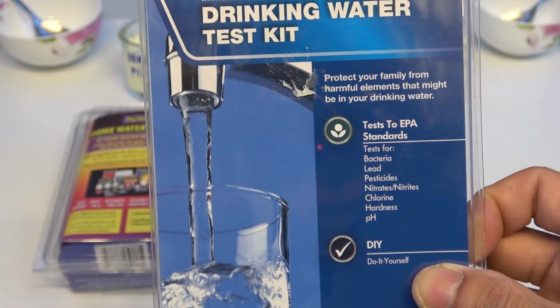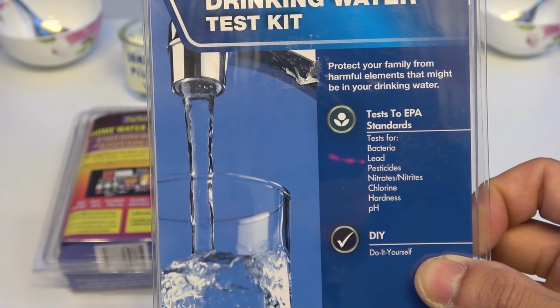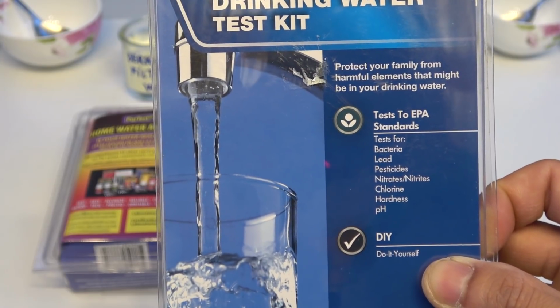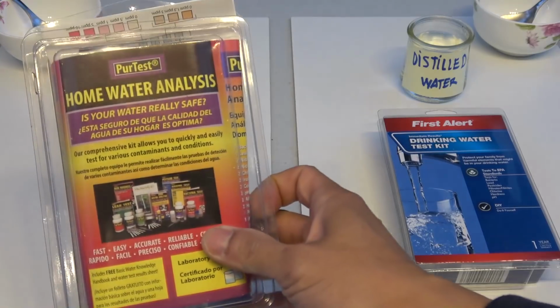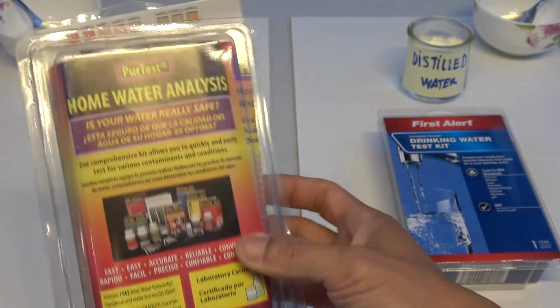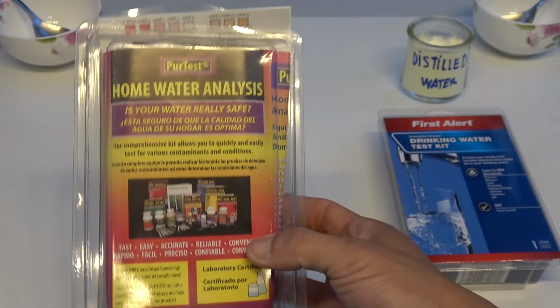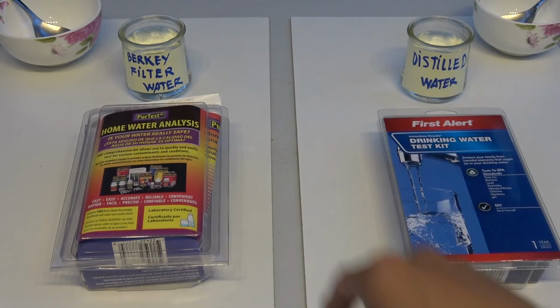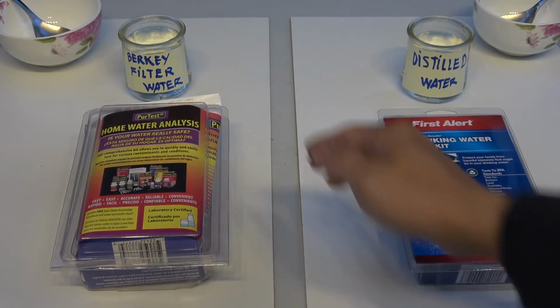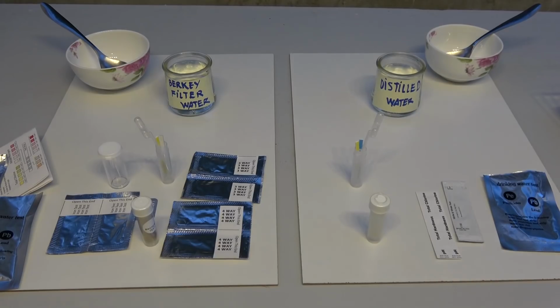So I got these test kits, and they test for a variety of different contaminants in the water. I have 2 test kits with different brands. They look different, and they are made by different manufacturers, but the tests are exactly the same. Because I've got 2 test kits here, I think I'll test the Berkey filter water also. The Berkey filter water is the water I've been using before I had the water distiller.